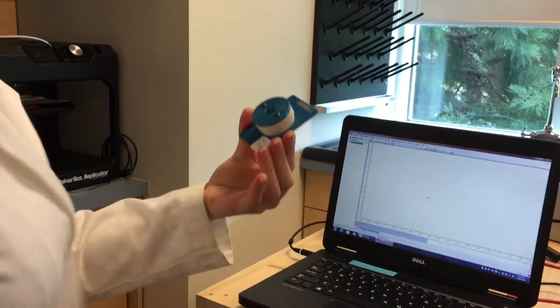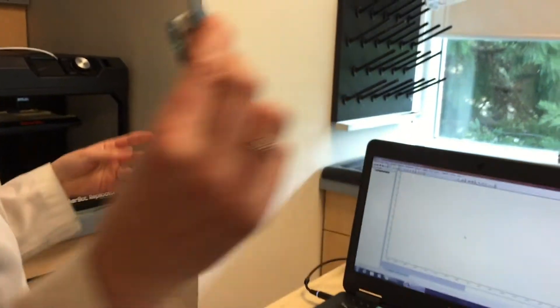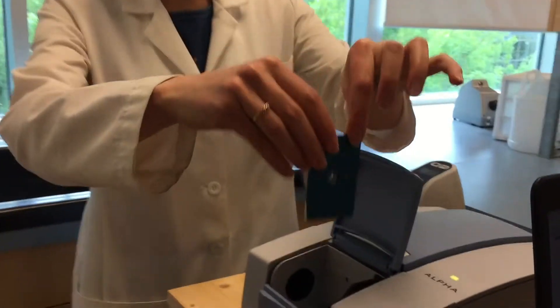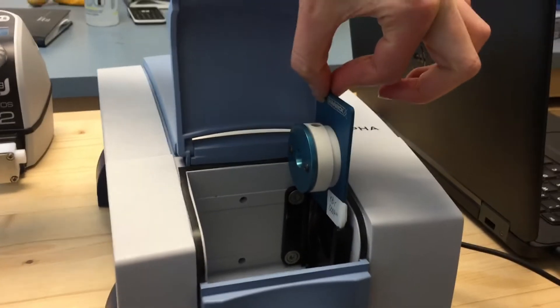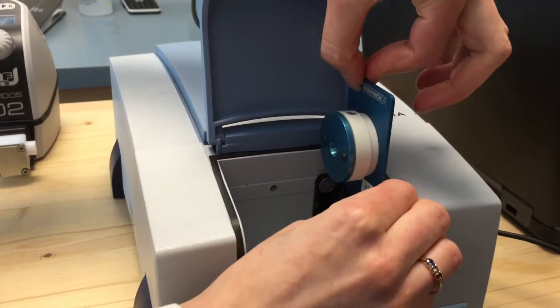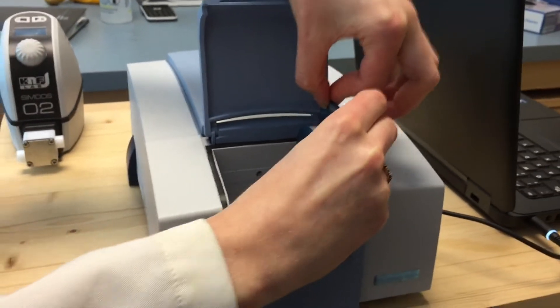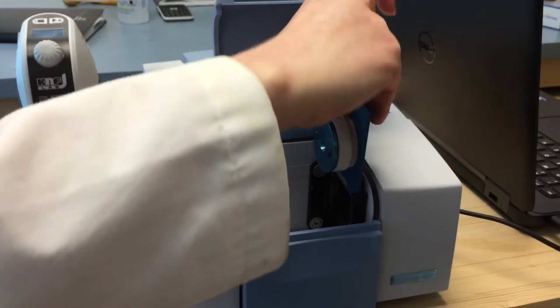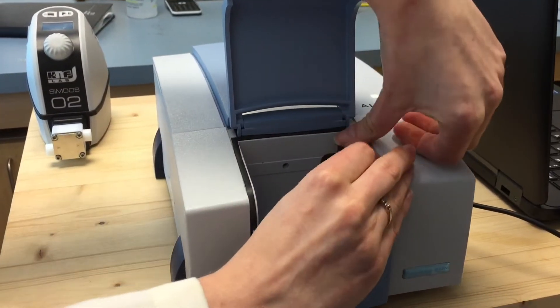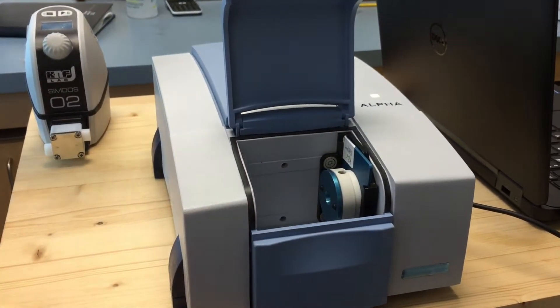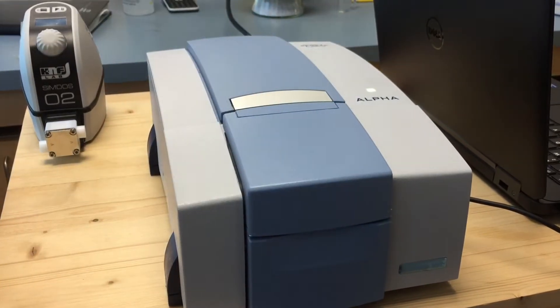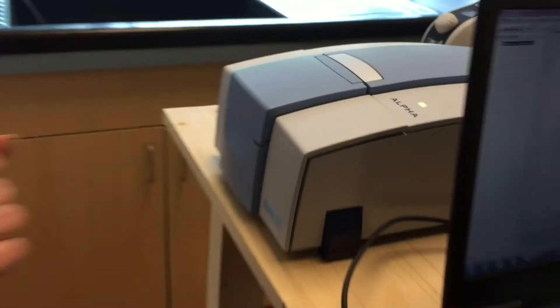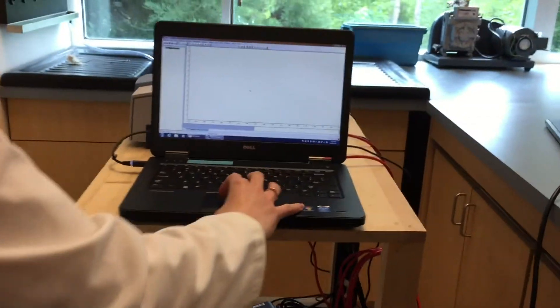Now to get a background spectrum, I'm going to take this and slide it into the holder in here. Slide in. Hold it upside down, it's better. Actually both sides are the same. It doesn't matter if it's upside down or right way up. Okay, close it up.